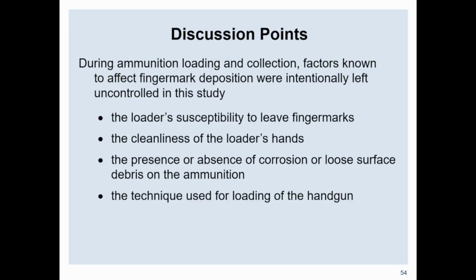But there are a number of things that would sort of limit the findings or are worth stressing. During ammunition loading and collection, we didn't assess factors that are known to affect finger mark deposition. And they were intentionally left uncontrolled in this study because we're trying to get a representative range. But the loader's susceptibility to leave finger marks is known to vary.